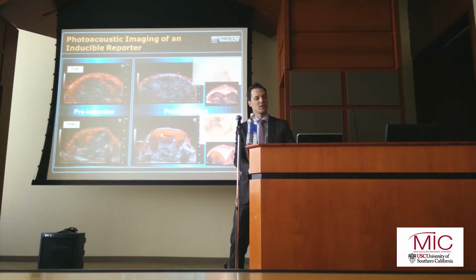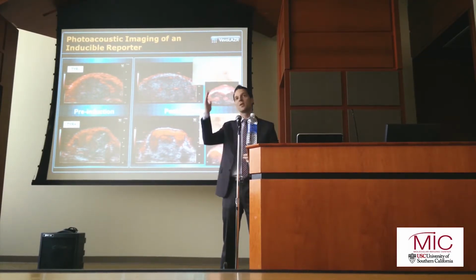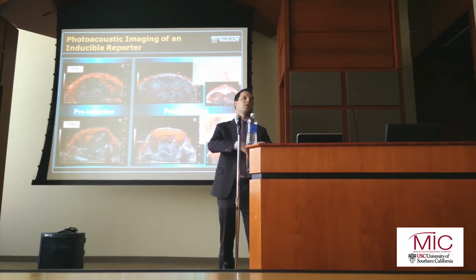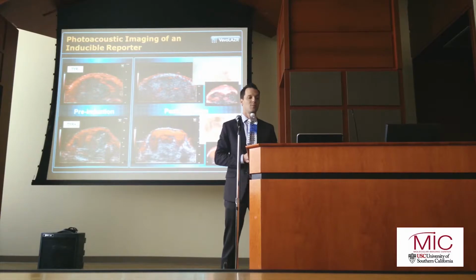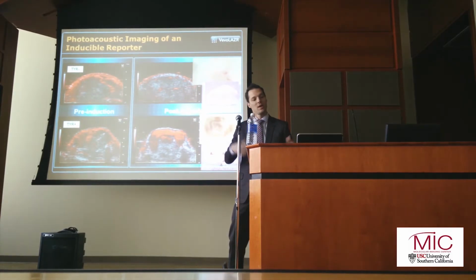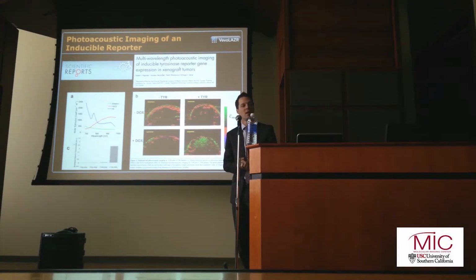Now, post-induction, a little over a week later, you see this huge signal accumulating in the tyrosinase positive tumor and nothing in the tyrosinase negative tumor. And sure enough, when you cut these tumors open, you see a huge amount of melanin expression in the tyrosinase positive tumor, none in the tyrosinase negative tumor. Confirmed this by histology, and this was published in Scientific Reports.